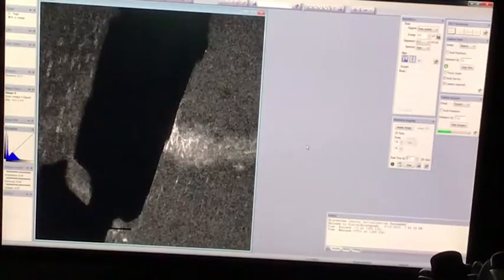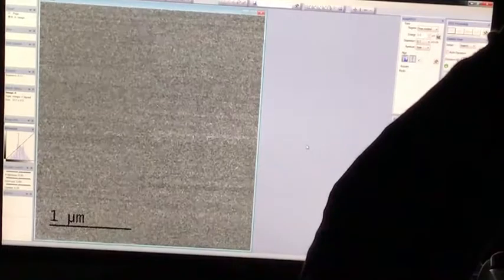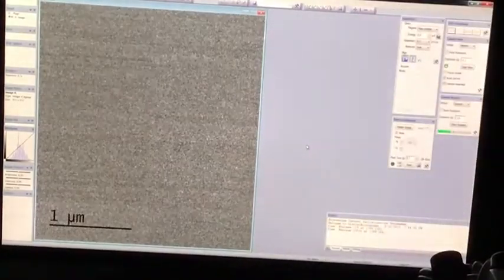I can't find the central beam without looking at the diffraction pattern. So I'm going to have to lower the viewing screen for a moment and do this live, because it's very hard to see what's going on. There we go. So there's the bright field image. You'll see it in a second. I'll lift the viewing screen again and you'll get a digital image. But aligning this aperture, with all the mechanical backlash associated with adjusting the mechanics, is a bit of a pest.